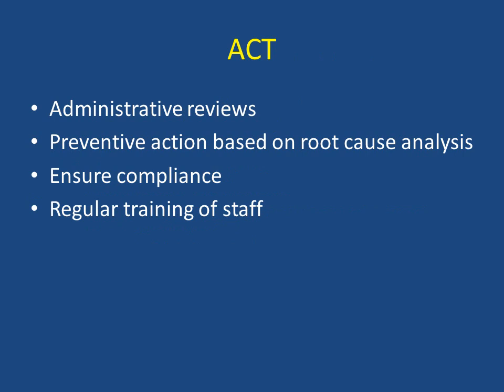Act. There should be administrative reviews to look at what's going on in the laboratory. There should be preventive action based on root cause analysis. There should be measures put in place to ensure compliance by the staff, and there should be regular training of staff, especially since there is a turnover of staff in the department.